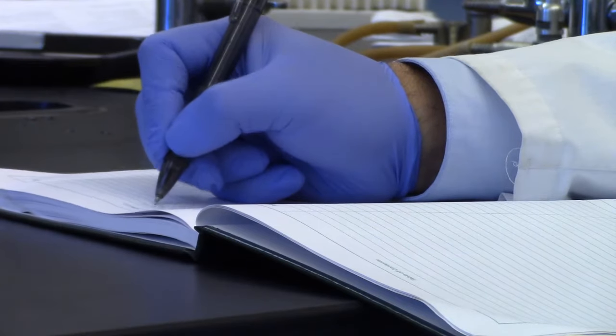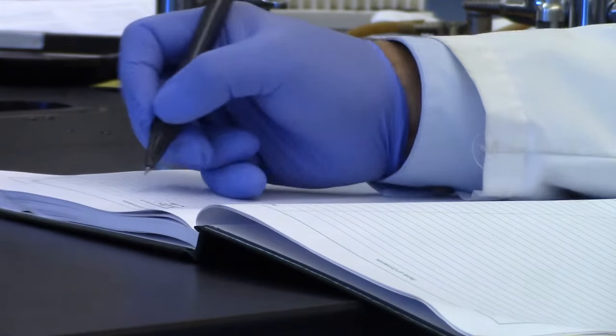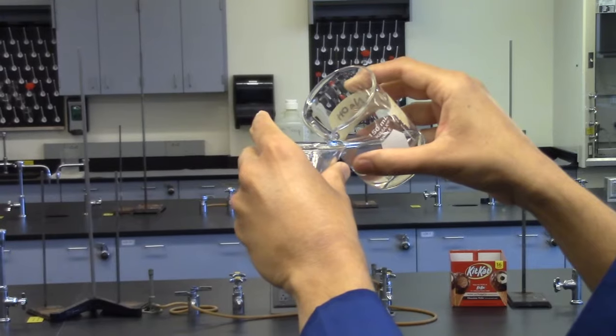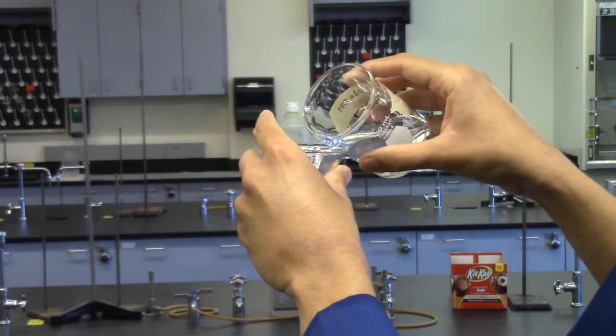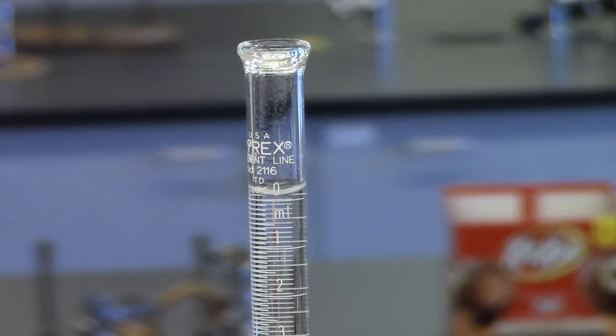B. Molarity of an unknown sulfuric acid solution. Record the number of the sulfuric acid unknown. Fill the burette with your standardized sodium hydroxide. Record initial burette reading.